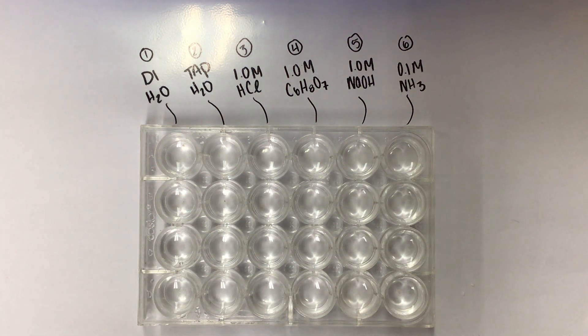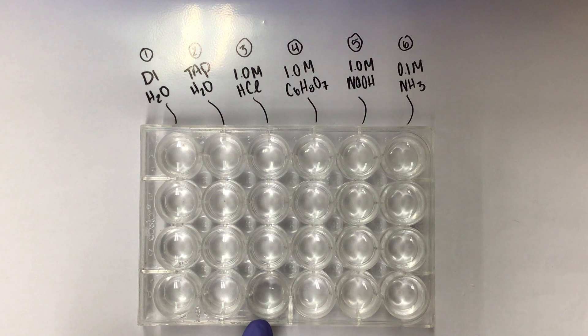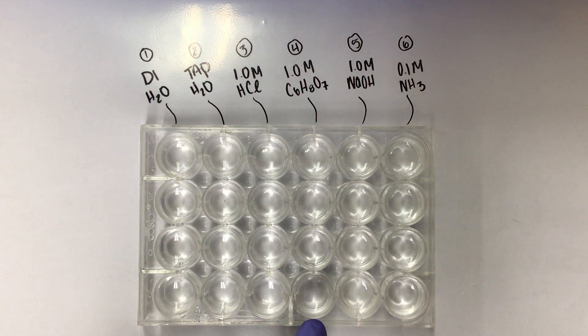I'm going to start with the conductivity indicator tests and reactivity section. In my well plate, I have DI water in the first column, tap water in the second column, 1.0 molar HCl in the third column, 1.0 molar C6H8O7 in the fourth column, 1.0 molar NaOH in the fifth column, and 0.1 molar NH3 in the last column.